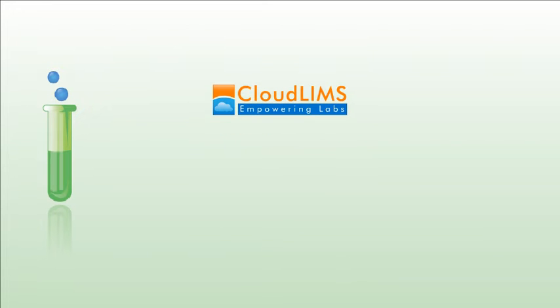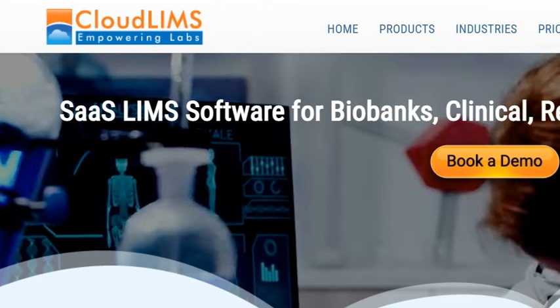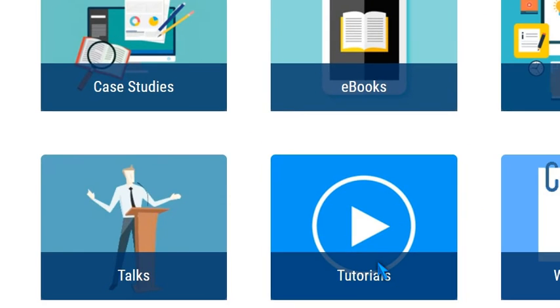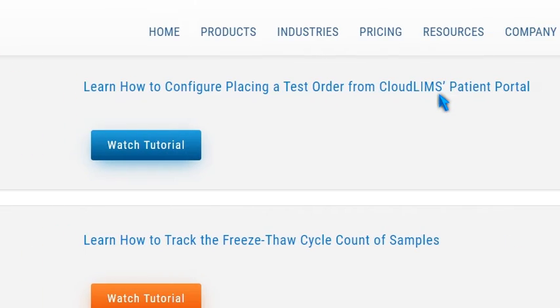In this video, we will walk you through the workflow of processing a test request placed by a patient from CloudLIMS Patient Portal. As a first step, you need to make the necessary settings required for a patient to place a test request. To learn how to configure the settings, watch the tutorial titled Learn How to Configure Placing a Test Order from CloudLIMS Patient Portal.